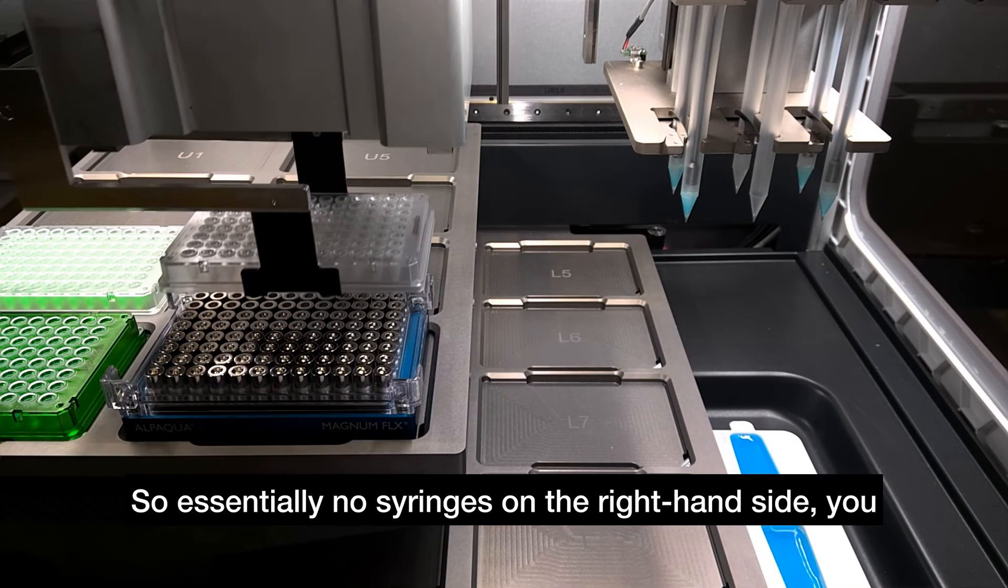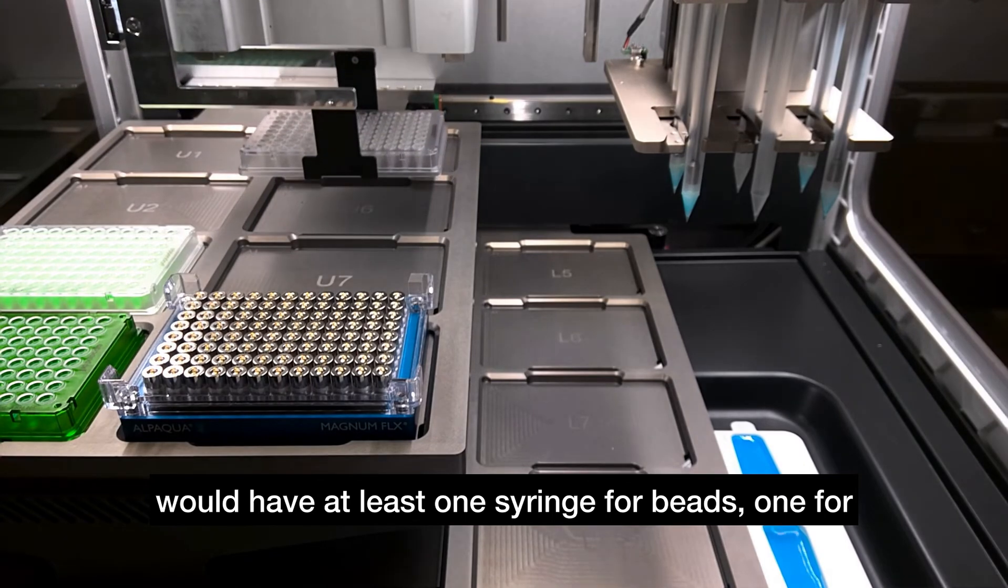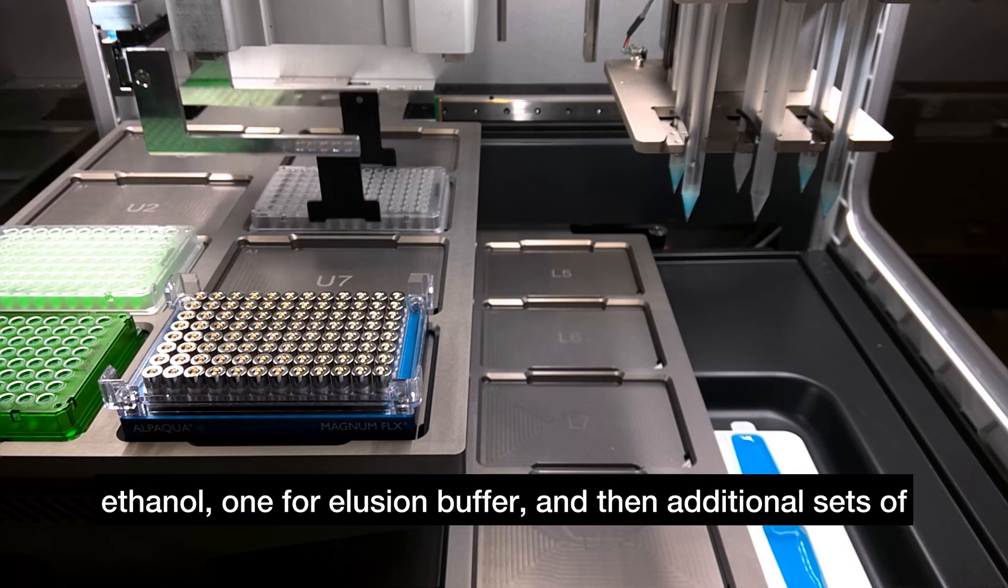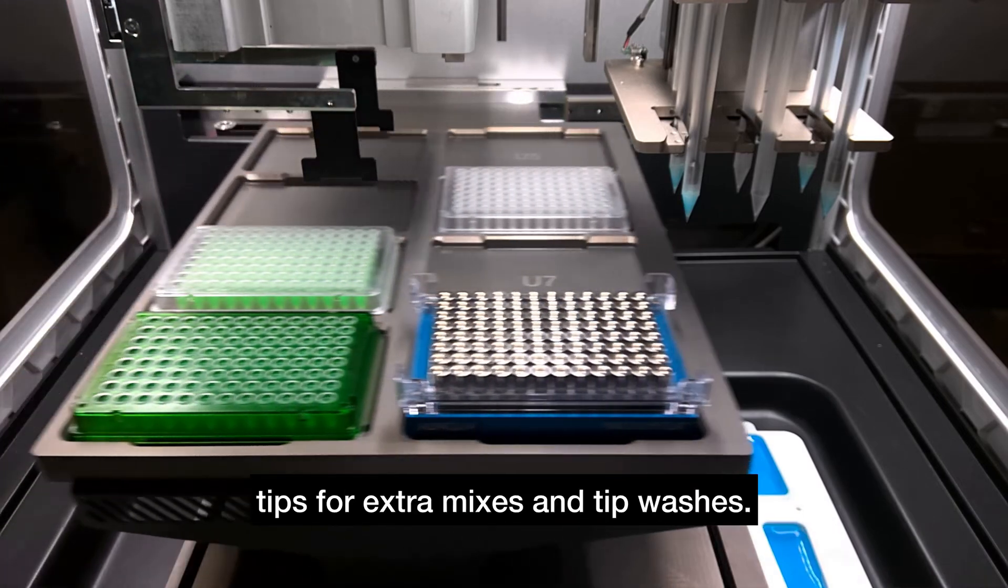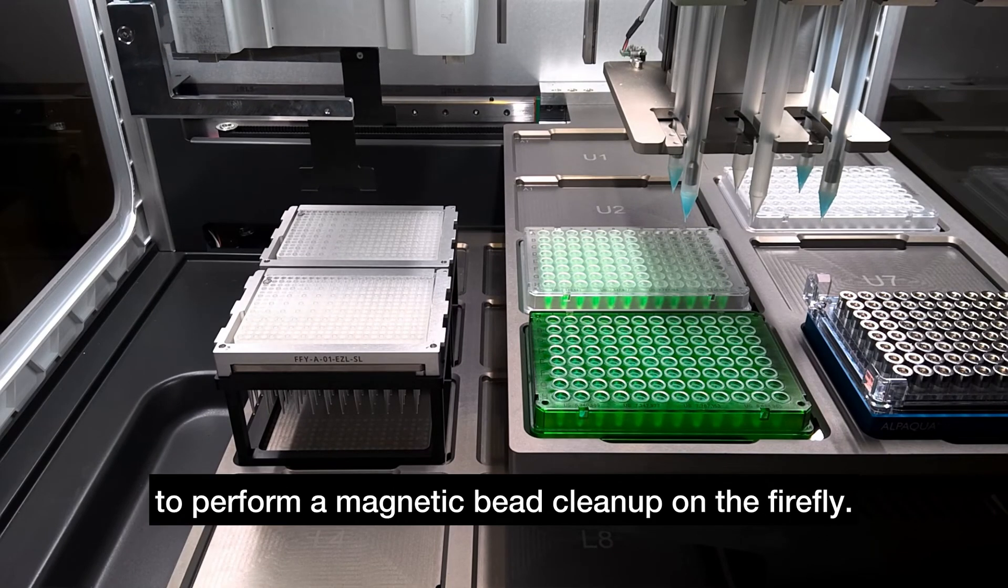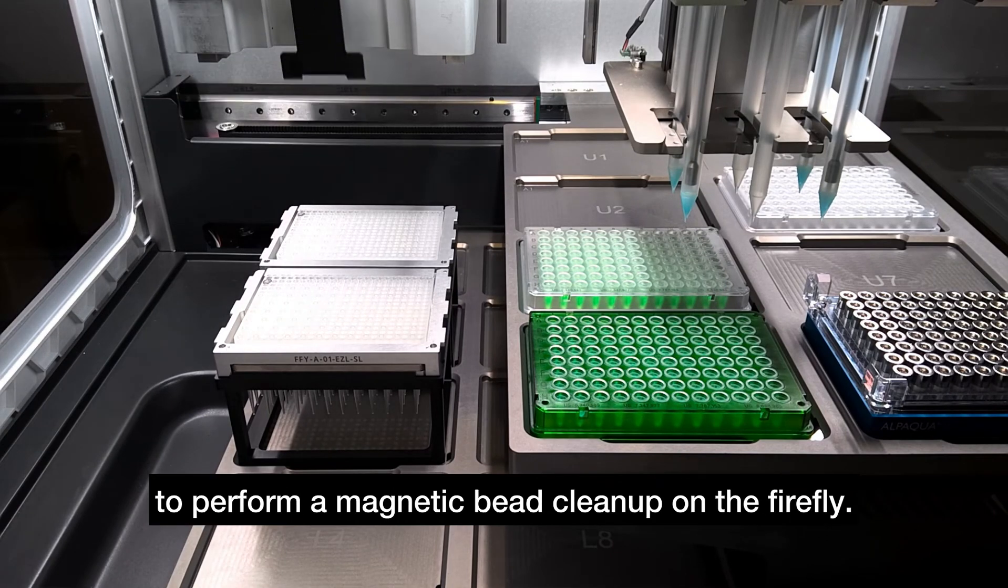So essentially in those syringes on the right hand side, you would have at least one syringe for beads, one for ethanol, one for elution buffer, and then additional sets of tips for extra mixes and tip washes. But hopefully you can see how easy it is to perform a magnetic bead cleanup on the Firefly.